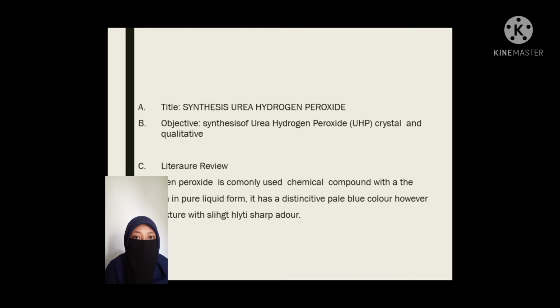Okay, here I will present about the synthesis of urea-hydrogen peroxide. The experiment is the synthesis of urea-hydrogen peroxide. The objective is to synthesize urea-hydrogen peroxide crystals and do a qualitative analysis.